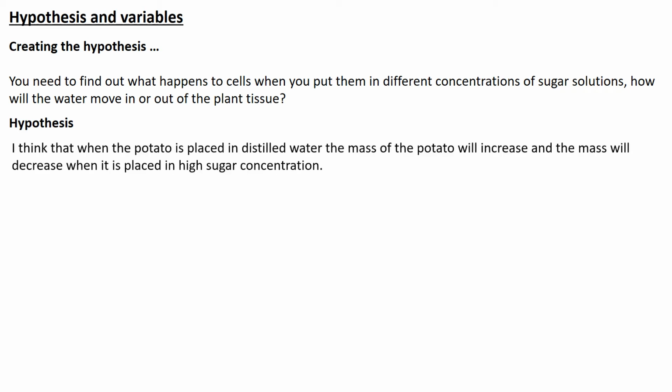So I think the potato that is placed in distilled water, the mass of the potato will increase, and the mass will decrease when it's placed in a sugar solution. And we need to think about that. Why will that happen? Because the water will move because of osmosis.